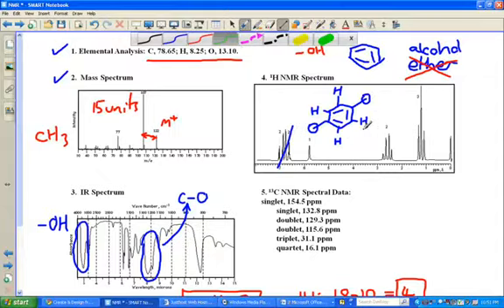The one functional group that we do know we have is the OH, the alcohol. Now, which of these 3 peaks do you think would be the OH? Well, it has to be the one that has an integration of 1, unless there's more than one peak that has an integration of 1, and in this case there isn't. And notice also that this peak is kind of broad. That is broadened due to the OH equilibrating with water molecules inside the tube when it's being run through the NMR. So that suggests the OH is somewhere in that molecule, and that's what this is.